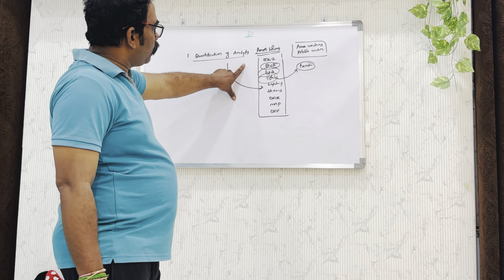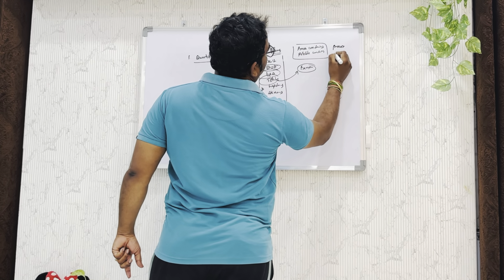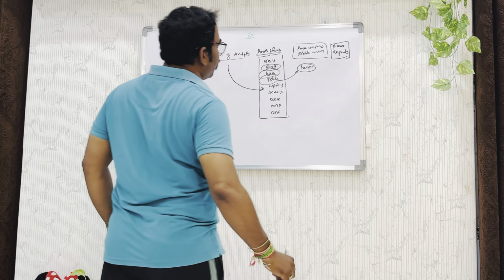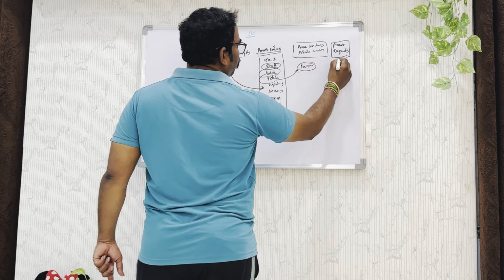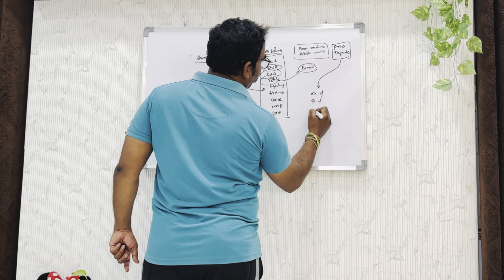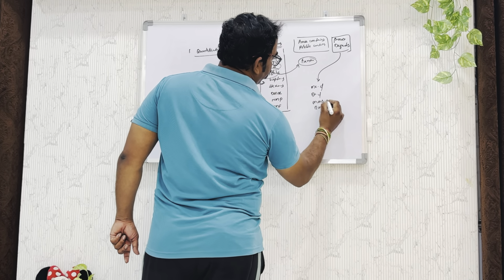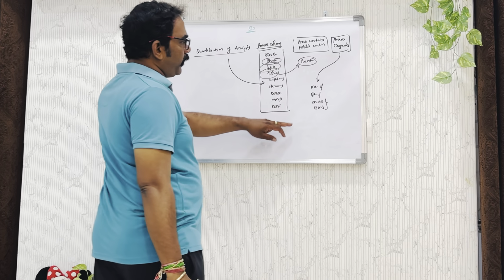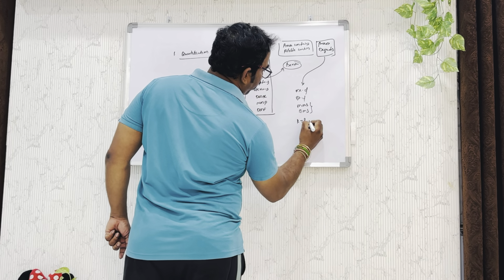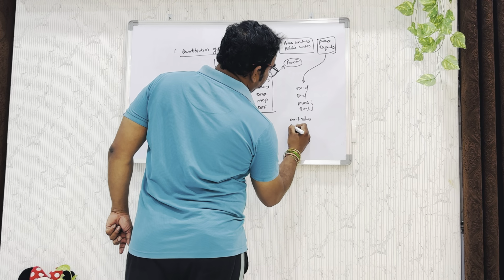Further, we need to quantify process degradants. Here process degradants might be methyl chloride, ethyl chloride, MMS, EMS, meaning methyl methane sulfonate and ethyl methane sulfonate, another one methyl para-toluene sulfonate, and ethyl para-toluene sulfonate.